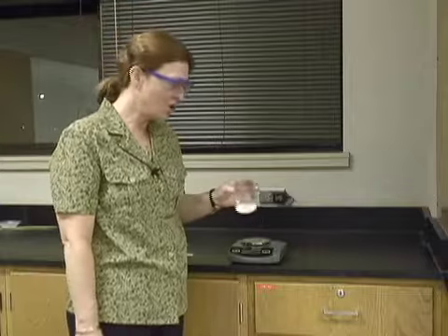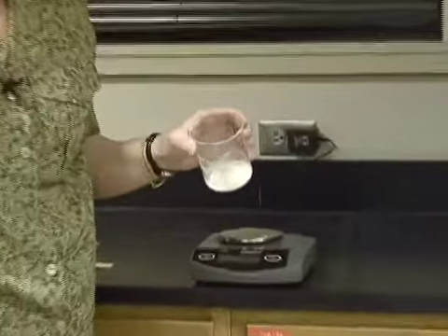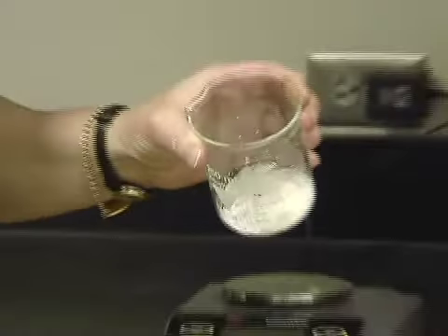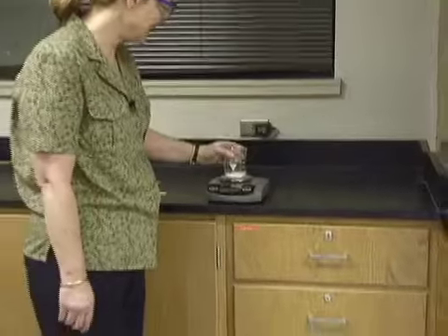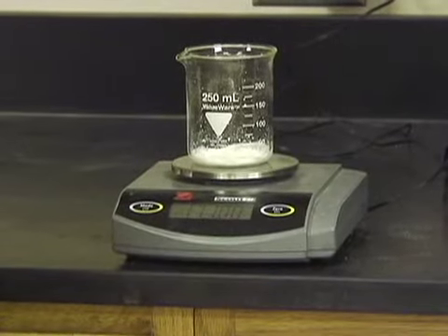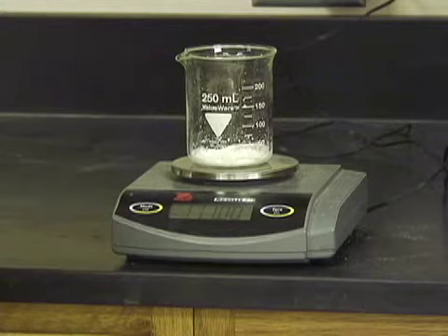Well, here we are. Look at that beautiful white crystal. That is some nice crystal that we got there. Now, I'm going to put this on my balance and get a weight. And it's 111.00.